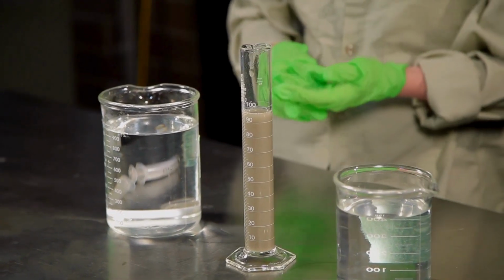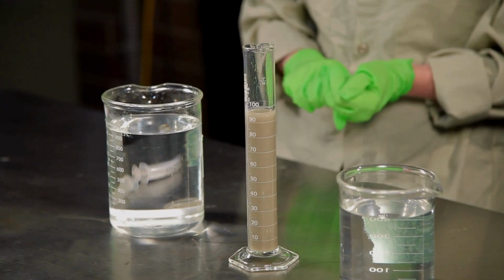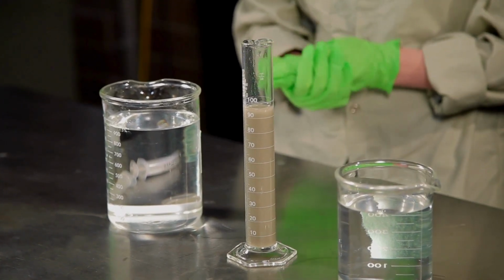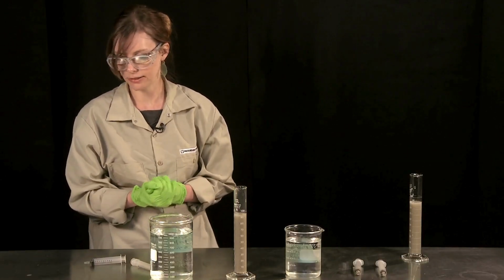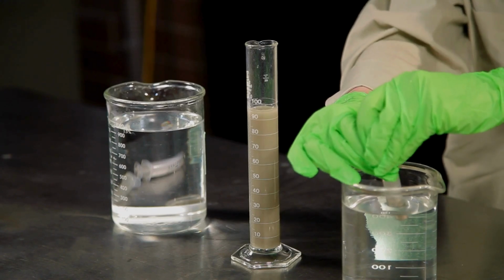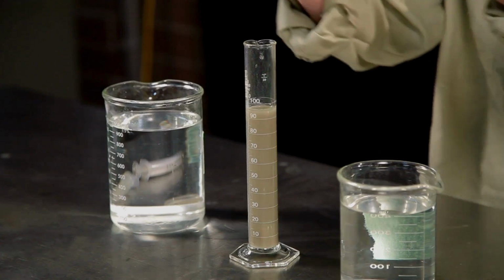Now we see that the fine particles are forming small agglomerates and are no longer dispersed. The slurry is now coagulating, or coagulated. So this material is now ready for flocculation. Once again, I'll be adding 1 ml of flocculant, so the same dose as we had before.